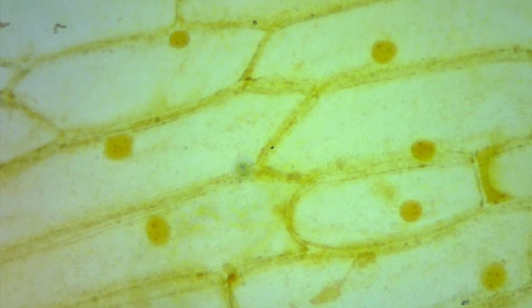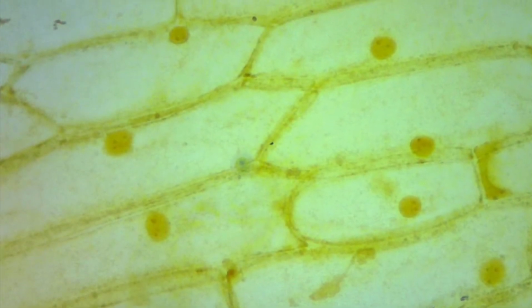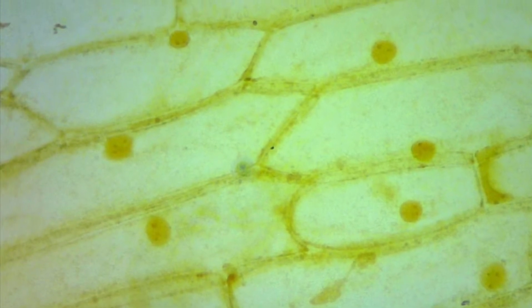As seen here, you will see the cell wall attaching to each and every one of those cells. Therefore, the onion having many cells makes it a tissue here. The membrane is composed of many cells, and a tissue is made up of many cells.